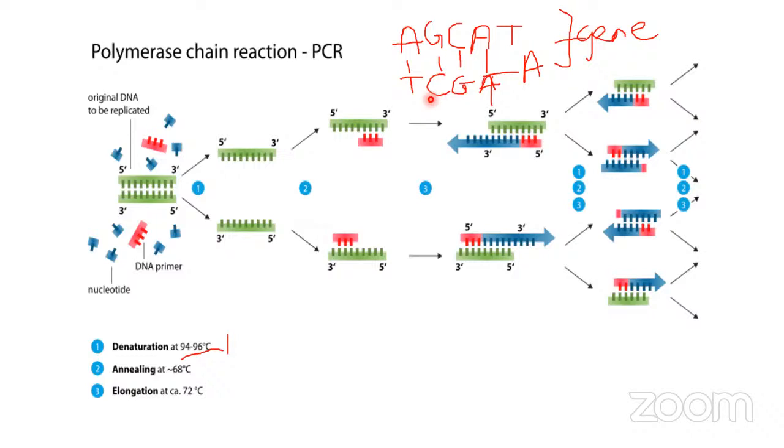And then when you have unused primers, they form what you call primer dimers, which you can see on the gel if you're using gel electrophoresis to see your product of PCR. You will see all that when we do module 2, looking at challenges of results, what challenges you can get, and how to rectify them.